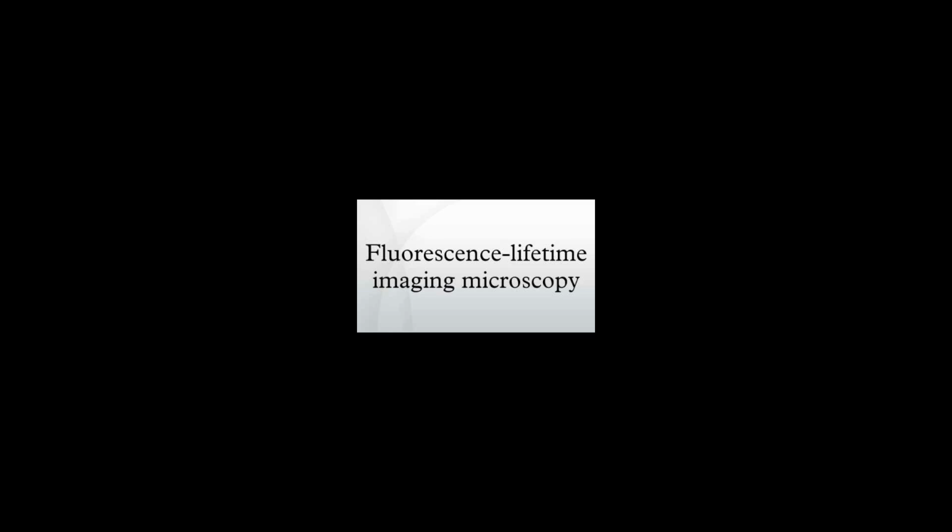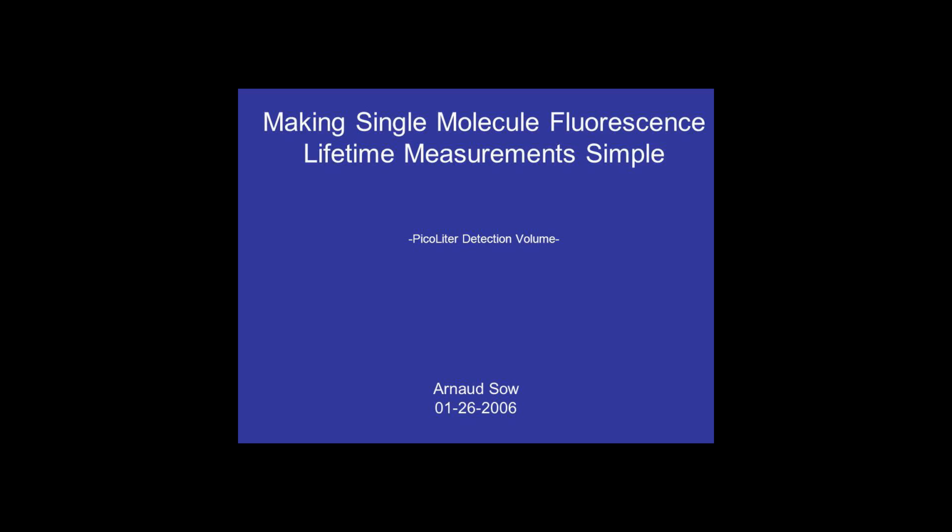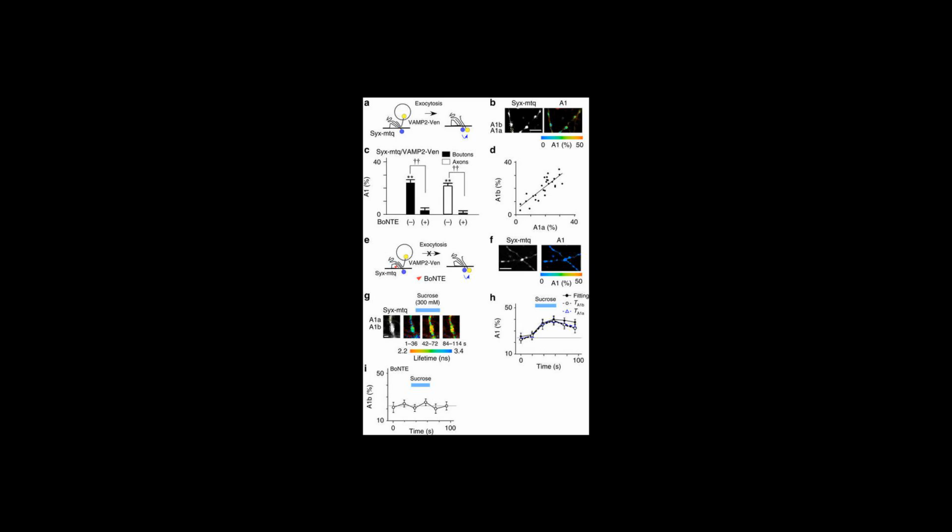With respect to the excitation laser pulse, the recordings are repeated for multiple laser pulses, and after enough recorded events, one is able to build a histogram of the number of events across all of these recorded time points. This histogram can then be fit to an exponential function that contains the exponential lifetime decay function of interest, and the lifetime parameter can accordingly be extracted.